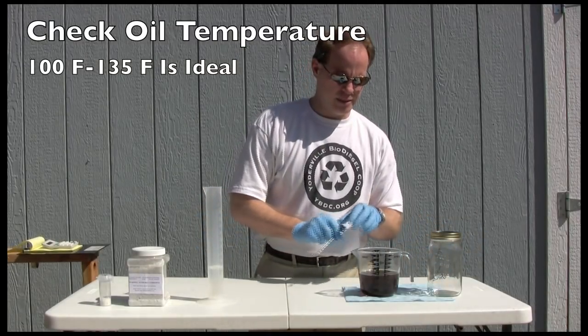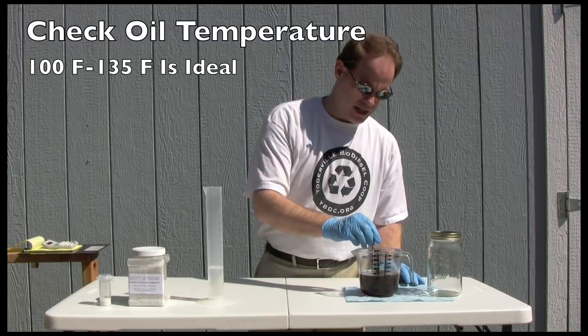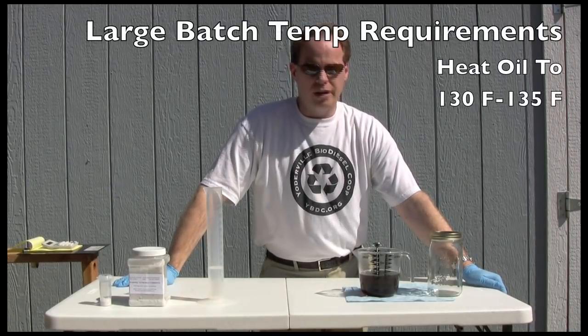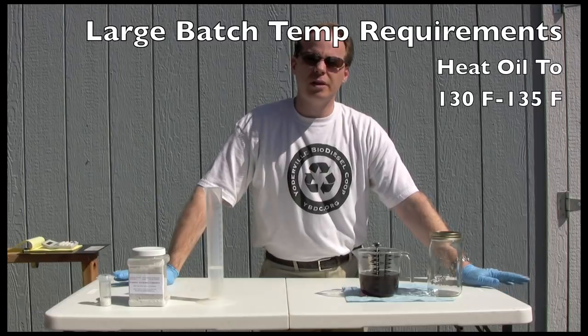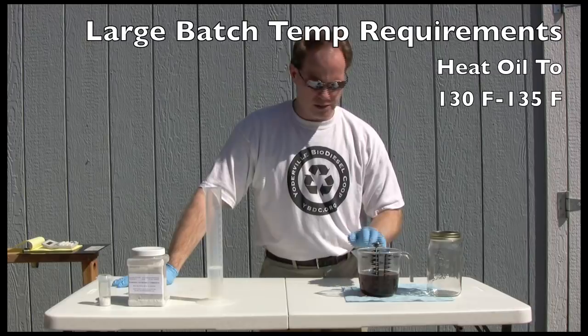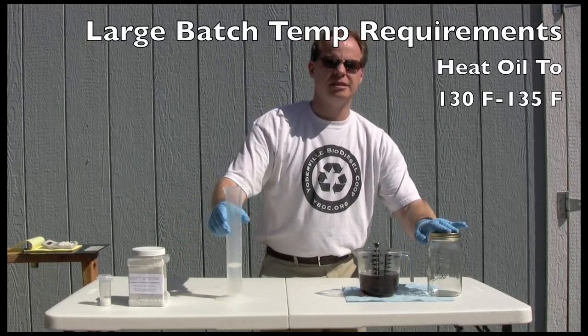While the catalyst is dissolving, you can check the temperature of your oil. I've heated this up and I'm sitting at right about 135°F. When making it in larger equipment, you want to heat your oil up to about 130 to 135 degrees. You don't want to go over 145 because we don't want to start boiling your methanol off. So my oil is ready and once the catalyst is dissolved, we'll make our biodiesel in this jar.